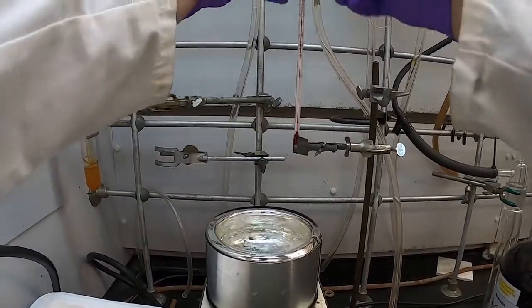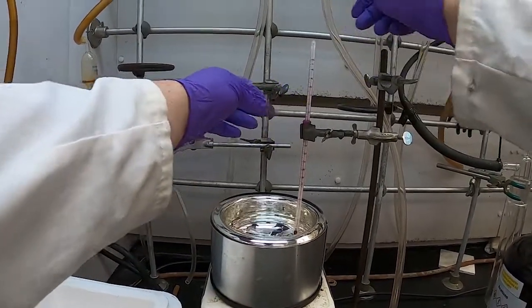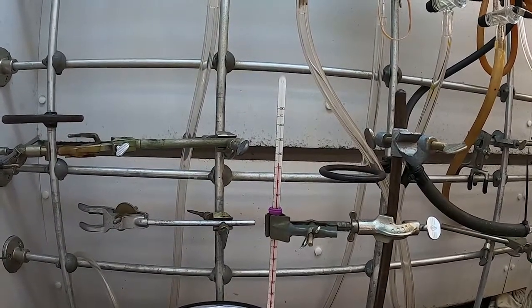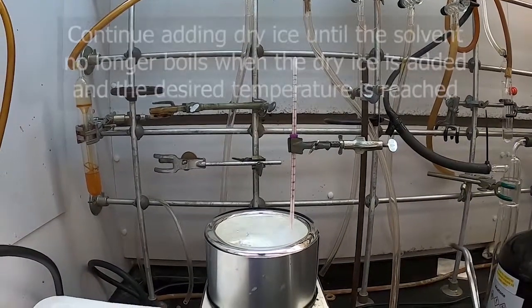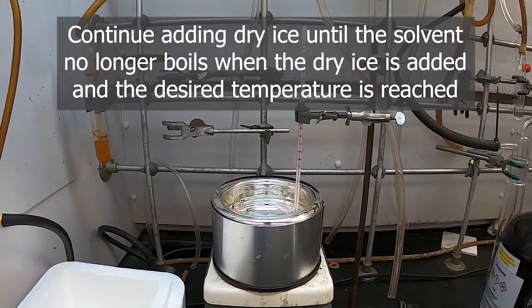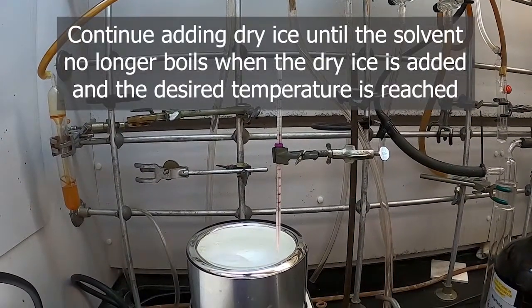So let's go ahead and put our thermometer in. Again, as we discussed about thermometers, it's important to have the correct kind of thermometer. This one has a negative 100, so it's a good place to start. So let's go ahead and put that thermometer in our acetone, and I hope you can see that our temperature is already plummeting. We were of course at room temperature about 22 degrees, and it's now dropping to 15, and we'll probably continue to drop. So let's add a smaller chunk of dry ice. Keep adding dry ice and bring it back when it's to temperature. So you can watch the thermometer there as I continue to add the dry ice. It's already at minus 5.